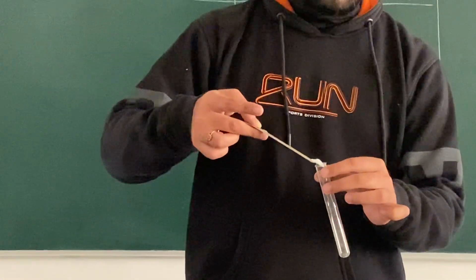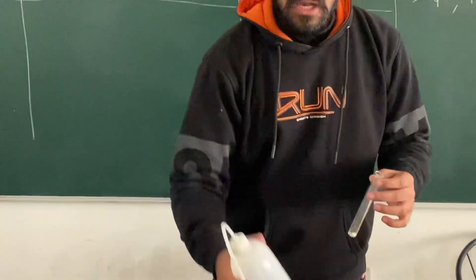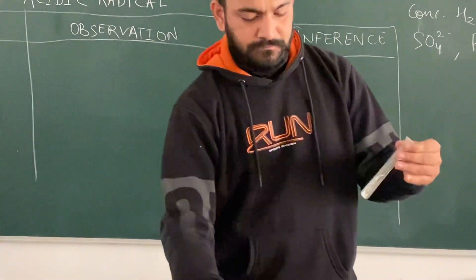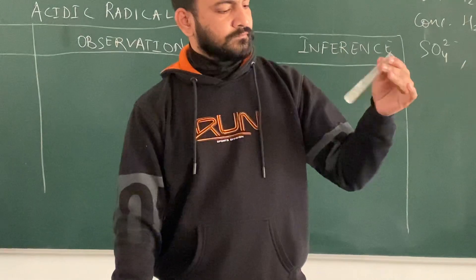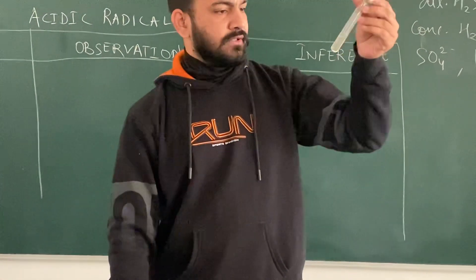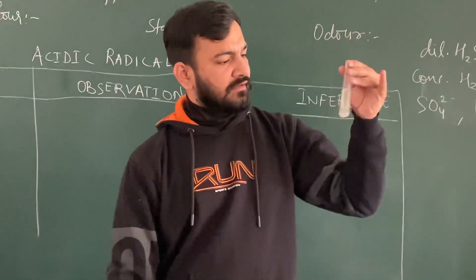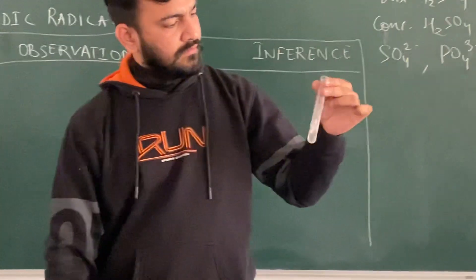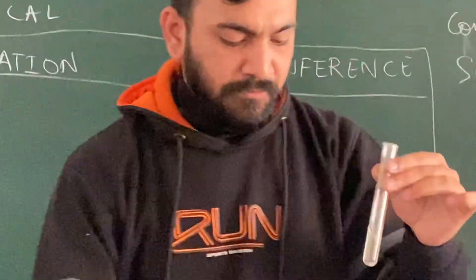Take a small amount of salt in the test tube. Add a small amount of distilled water and dissolve the salt. As you can see, some part of the salt is still left. Now the salt is completely dissolved.